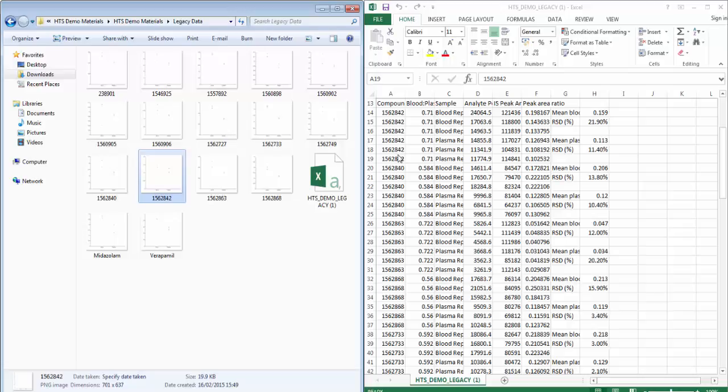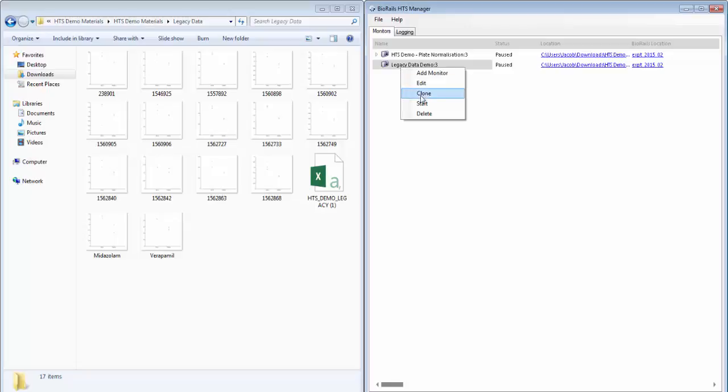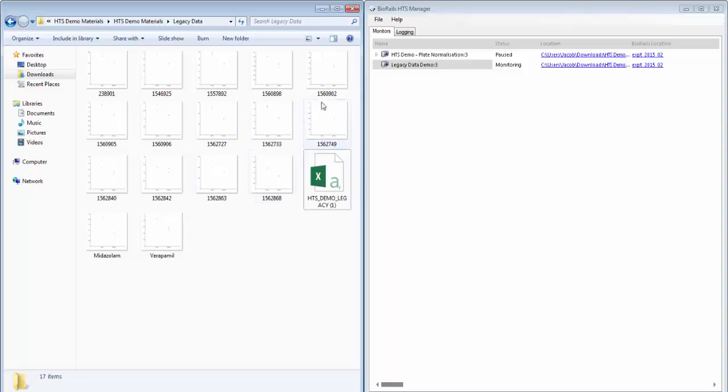HTS has been configured to upload these together to a new BioRails task. All we need to do now is start the monitor and HTS will begin polling this folder specified, this one on the left, and will look for the data files and the required charts to upload to a BioRails task.